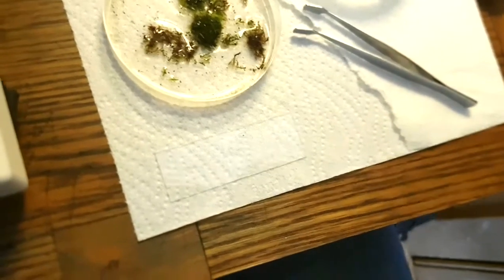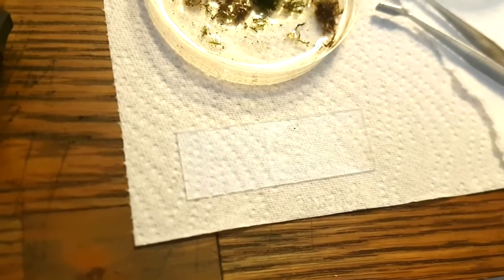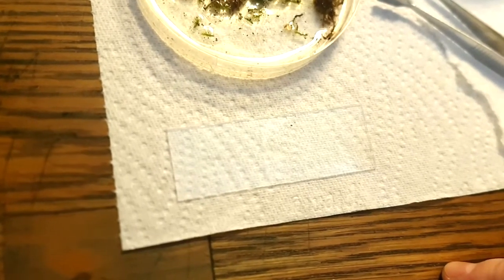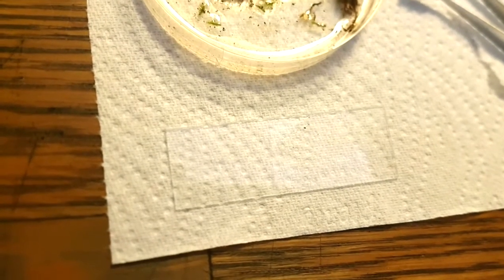Now, because I used rainwater for this, from rainwater that was just sitting there, there's a good chance that some of the microbes that I find in this sample have come from the water rather than just from on the moss. But if I see anything interesting, I will hit record on my camera, then we can have a look together at what's in this sample.